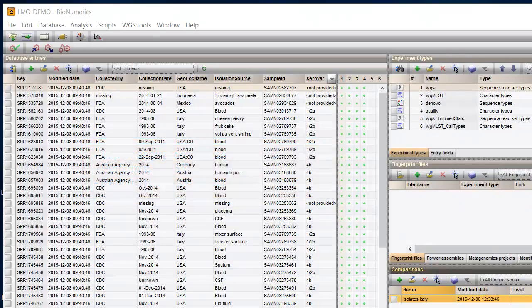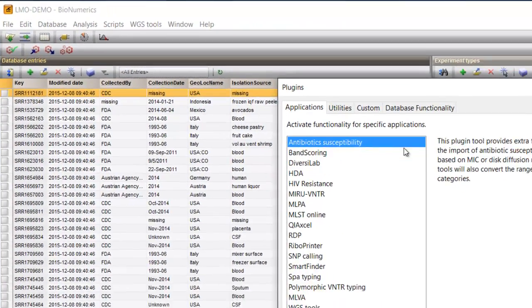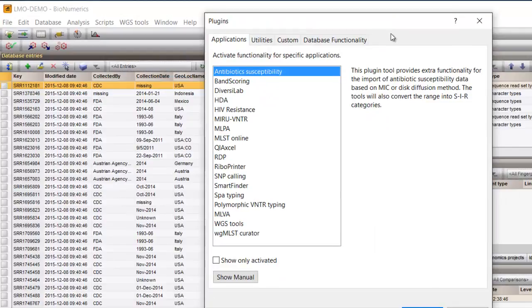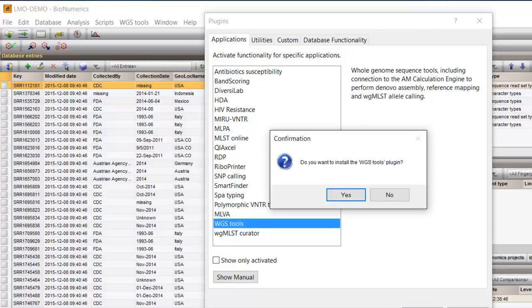To install the plugin, click the Install-Remove Plugins button and highlight the Whole Genome Sequence Tools plugin. Next, click Activate and confirm the installation of the plugin.